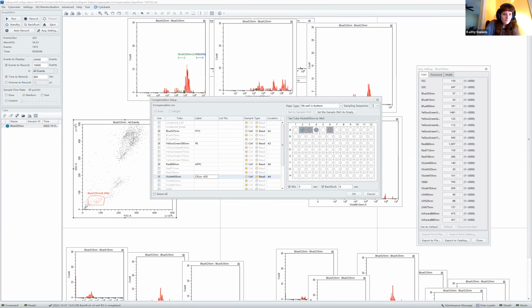Okay, so as we're going along, I said we don't have an unstained control today, our unstained bead. We're running these beads that actually do have an internal negative, so I'm going to skip it. The one thing that is unfortunate is it doesn't let me choose unstained bead after I've already gone ahead and recorded something without an unstained bead control. So that was actually the reason why we're not going to run that unstained bead today. I physically cannot click it at this point anymore to add it on.